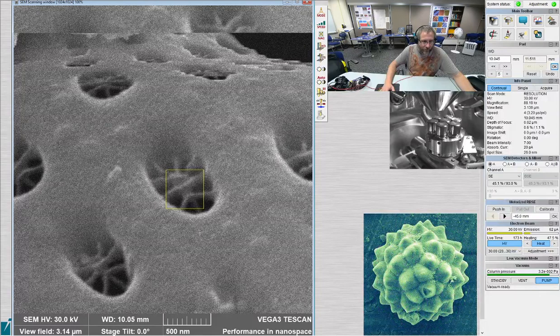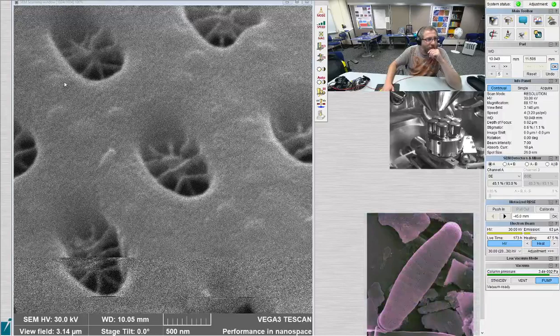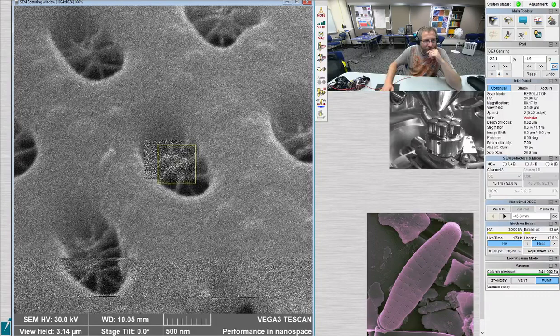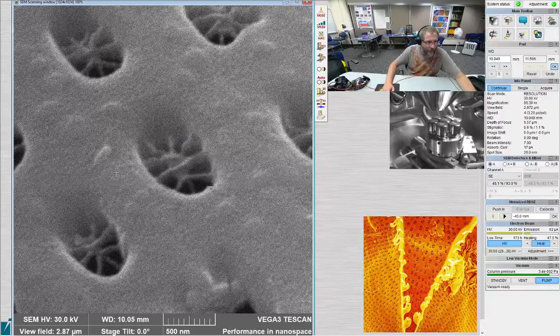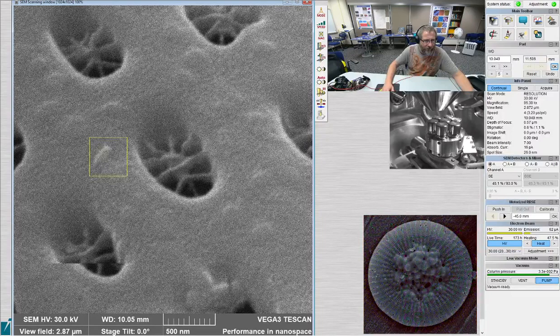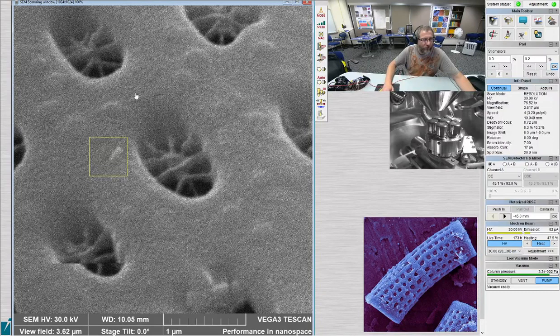Yeah, so let me actually play with some settings, and maybe you can see what chat's saying, and see if Mark has answered the email at all. The wobble is perfect. We're at 500 nanometers, and it's not moving, so I will accept that. And the stigmation is still a question mark, but it looks like it's pretty good. There's always a fear that I'll tweak it and somehow it'll get worse. But I don't think so.